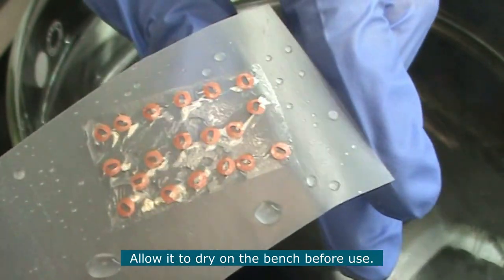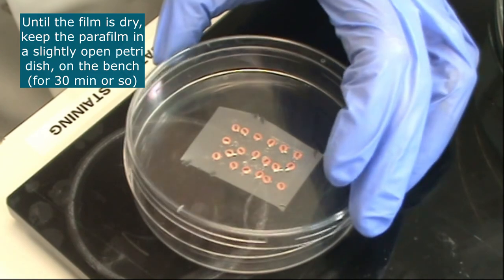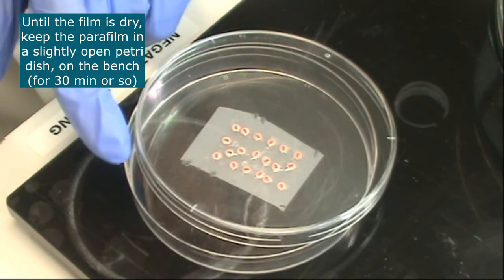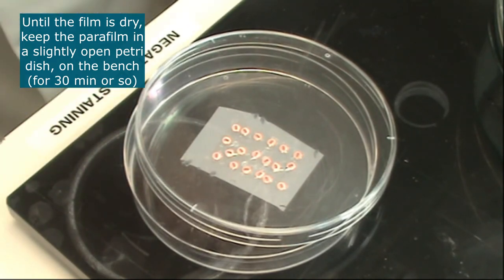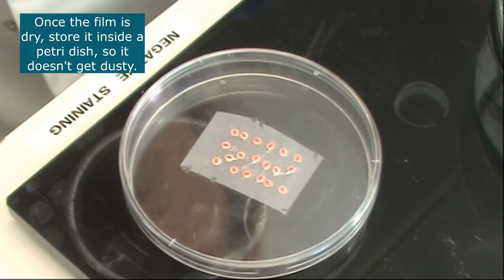You have to allow it to dry. Until the film is dry, you can keep the parafilm in a petri dish like this, slightly open, just so you allow the film to dry. Once the film's dry, keep your formvar with grids on inside a petri dish so that it doesn't get dusty.